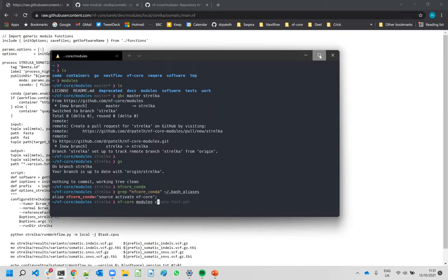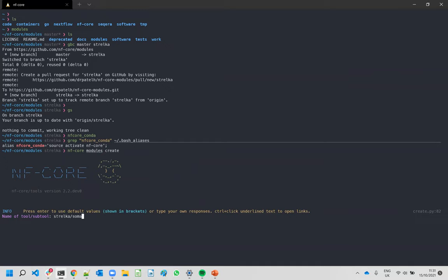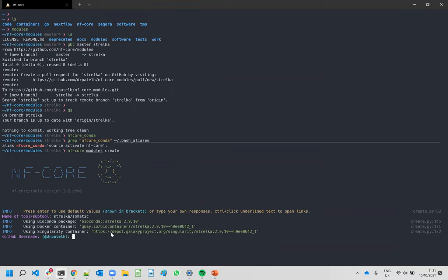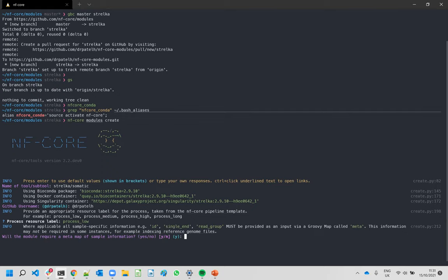Let's run 'nfcore modules create'. The name of the tool is strelka_somatic. What's really cool is that we're querying the BioContainers API — if possible, the tool will find an existing BioContainers container that begins with 'strelka'. You can see it has automatically found the BioContainers and Conda packages that need to be substituted in the module, so you don't have to go and look for them yourself. Then it asks for your name, and for the process resource label — we'll set it to 'low' for now.